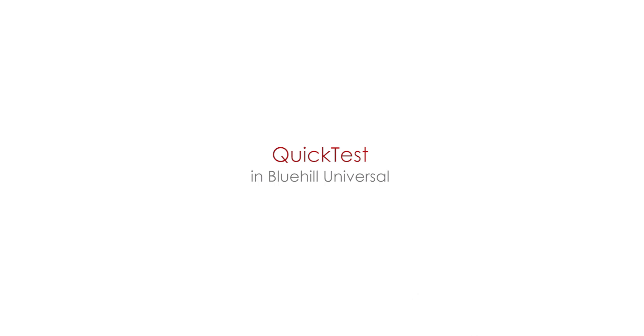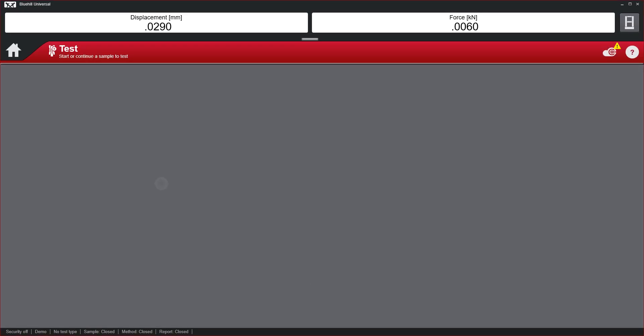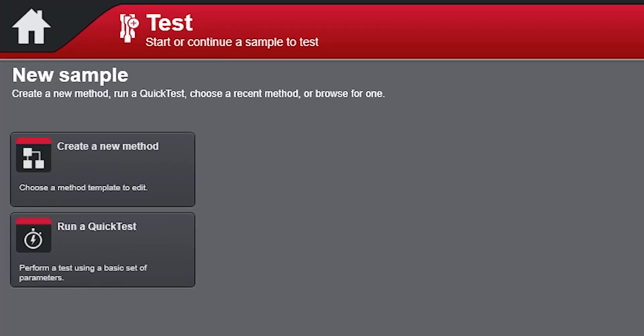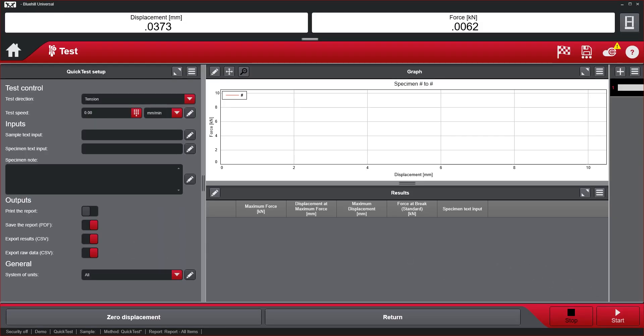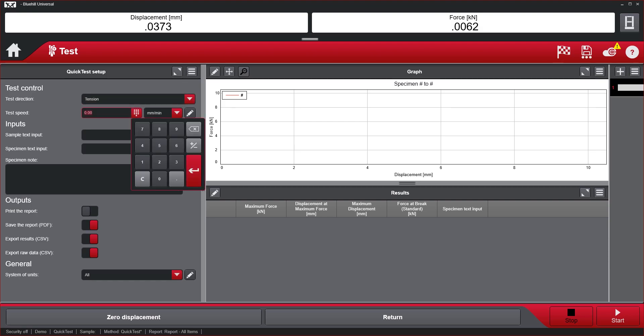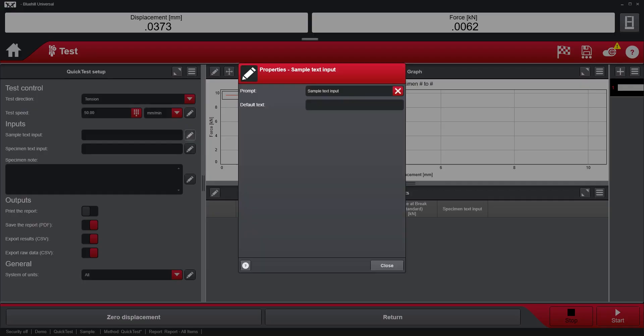QuickTest is a new test type in Bluehill Universal that provides a pre-configured method. QuickTest requires simple test parameter inputs including test direction, test speed, sample text input, and notes.